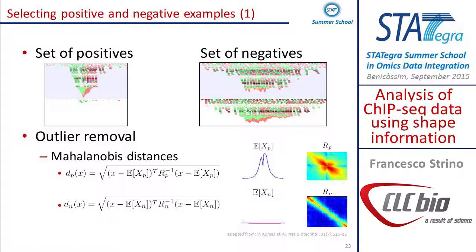So what this function means is that you look at the distances between the shape and the shape, but you also want to remove the correlation between points. And the main idea is that, let's say, for example, points that are here at the edge are really not that important, so you don't want to count them as much as things that are in the middle. So that's the main idea. We actually stretch things that are more important and give less importance to things that are not so much.